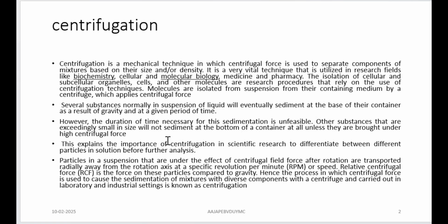liquid solution, sample solution, whatever you have, as a suspension of cells, for example, right? So with the help of gravitational force, the denser particles, or cells, you can say, will start settling based on properties like mass and density. All right. So if you just keep muddy water in a tube for a longer time, you will see some of the particles get settled and the water slowly becomes comparatively clearer, but some fine particles will not settle at all.